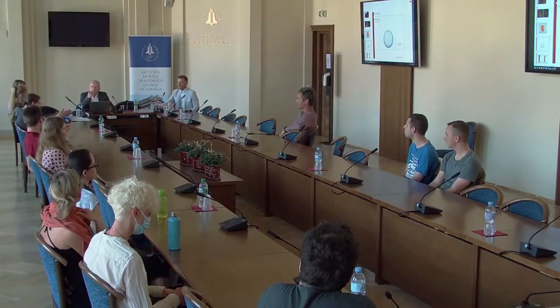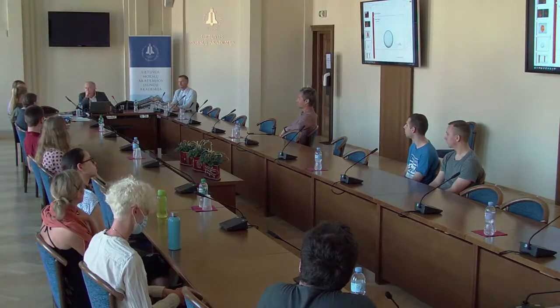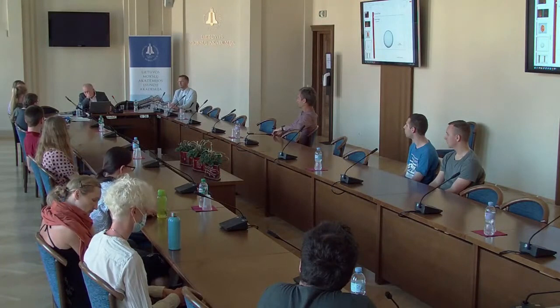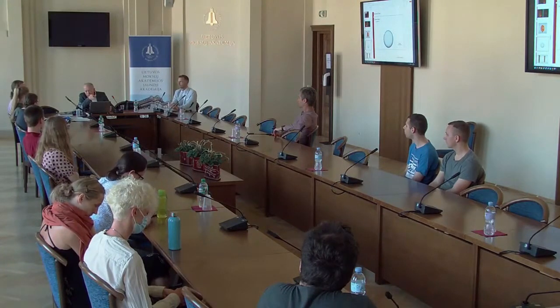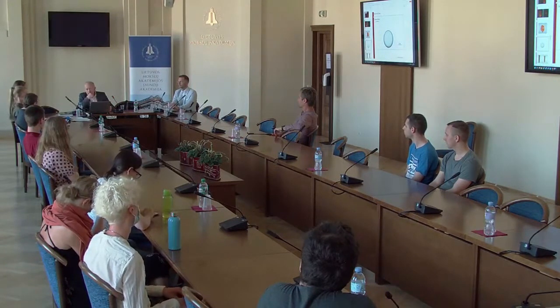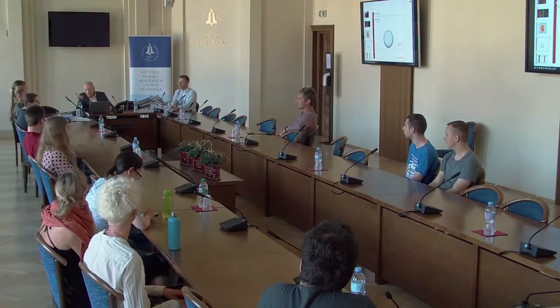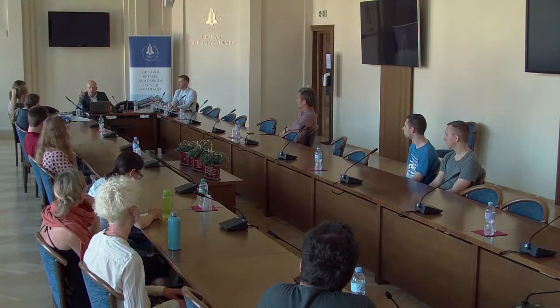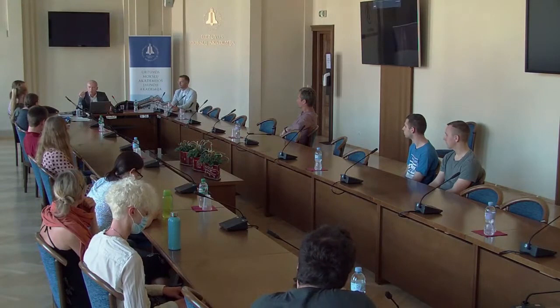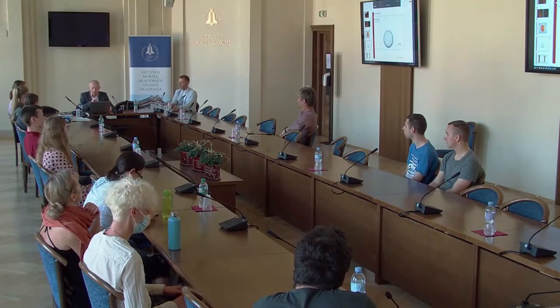Jo. Bet jeigu jūs norit matyti kažką išorėje ir kažką ten klijuojat, aš tada neklijuočiau toje vietoje, aš klijuočiau kitur. Jeigu man labai įdomus danties paviršius ir noriu pasižiūrėti, ar jis porėtas, tos vietos neklijuočiau. Aš čia palikčiau laisvą. Arba galima klijuoti, bet kito kontrasto klijais. Jeigu kontrastas skiriasi, iš karto išsiskiria, matai dantį. Labai gražiai dantis matosi: išorinis sluoksnis yra labai tankus, turi vieną grayscale, vidus yra kitas, tie įtrūkimai vėl.